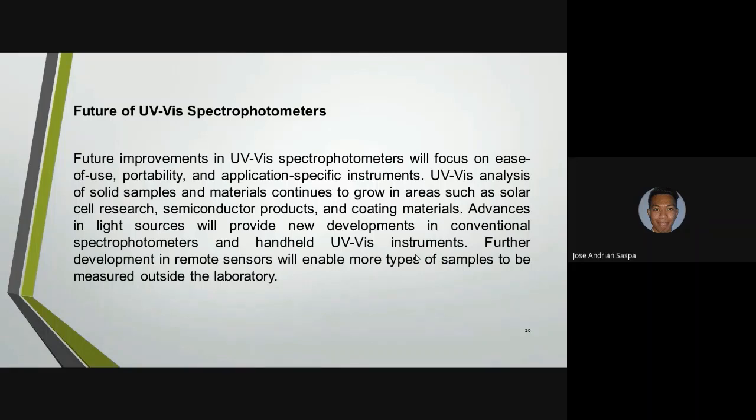So, the future of UV-vis spectrophotometers. Future improvements will focus on ease of use, portability, and application-specific instruments.